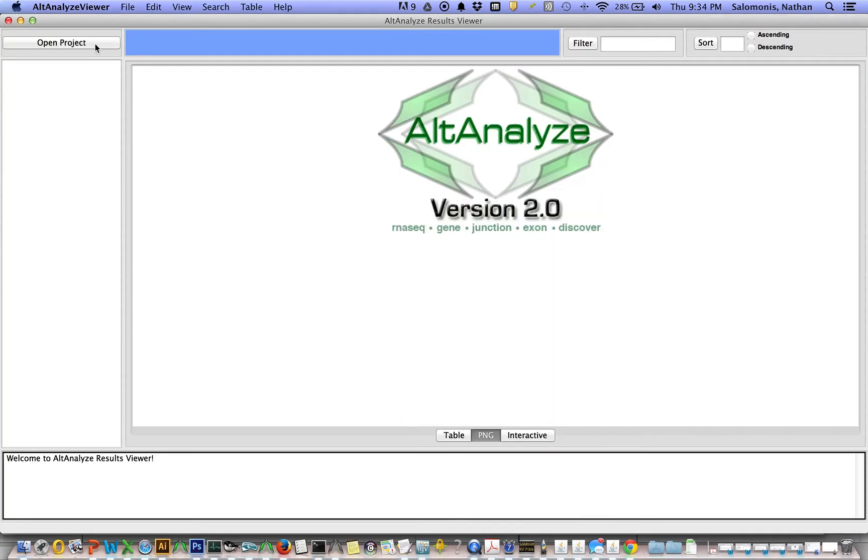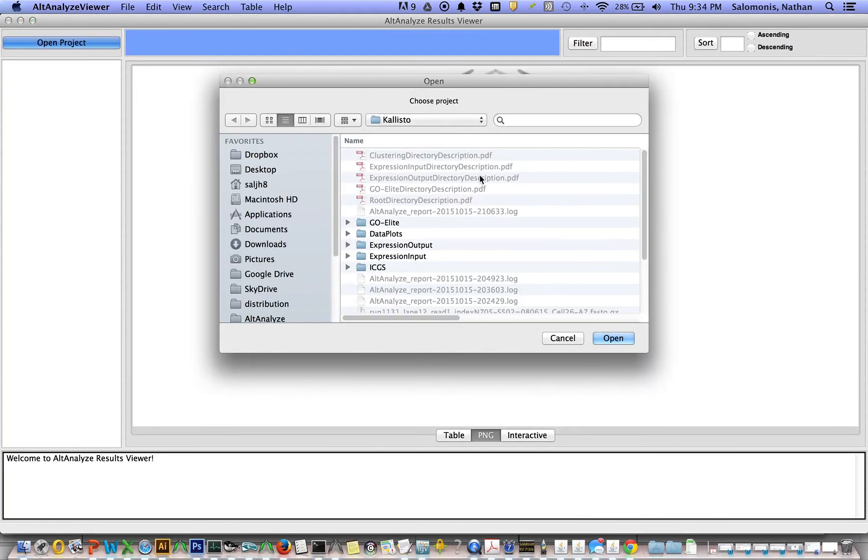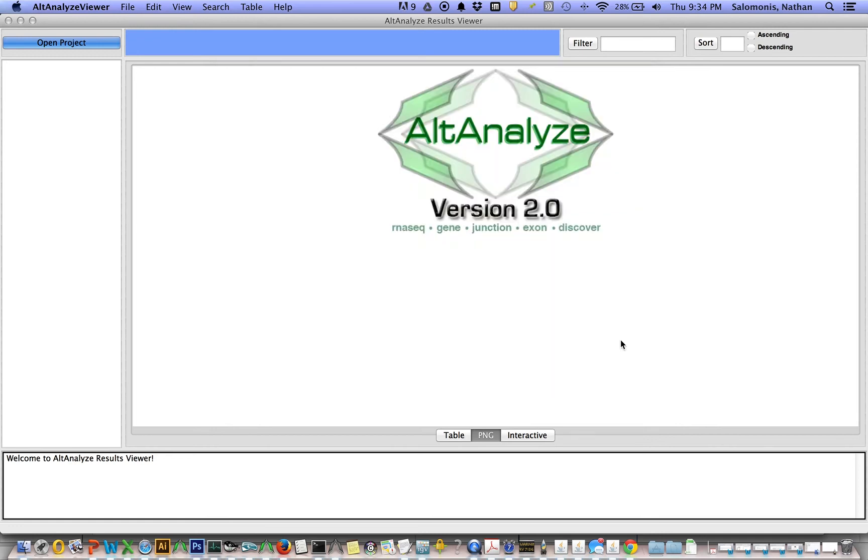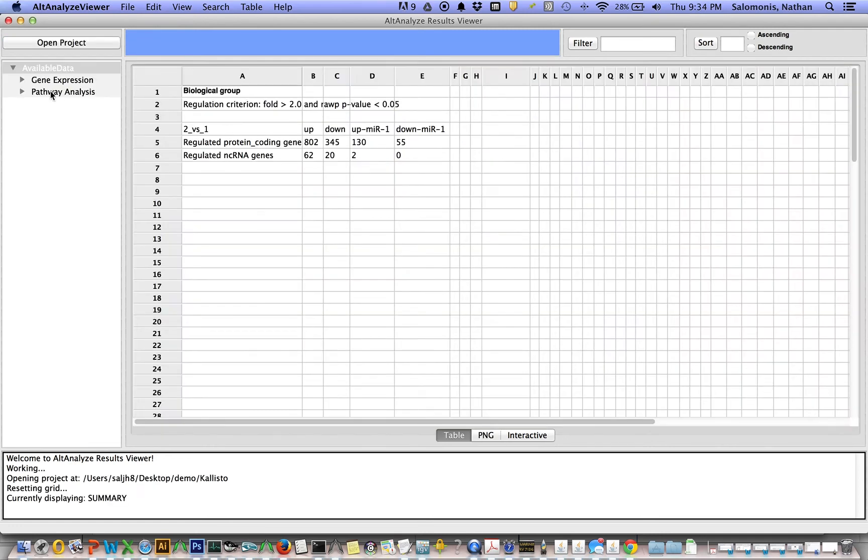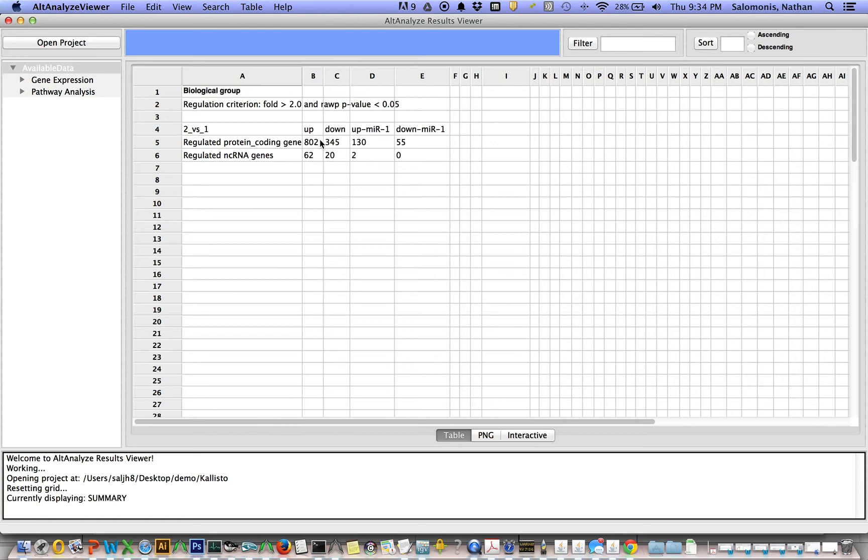You'll get this separate application. You select open projects, select the folder which results were saved to, in this case called Kallisto, and you'll immediately get a summary of your gene expression results. Here we have 802 genes upregulated. These are protein coding genes and 62 non-coding RNA genes from Ensembl that are also upregulated. You also see what the criterion was used to look at these differential expression results. These are user-defined from the AltAnalyze menu from the first steps in the analysis.